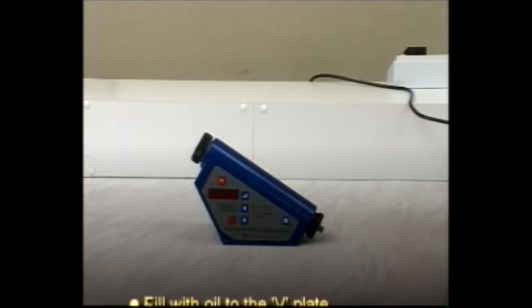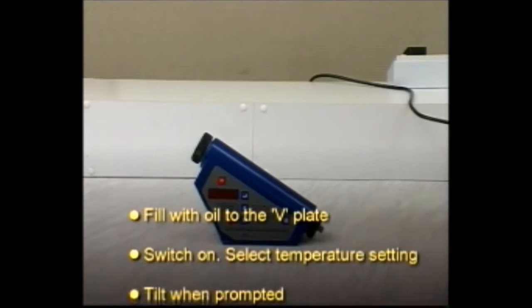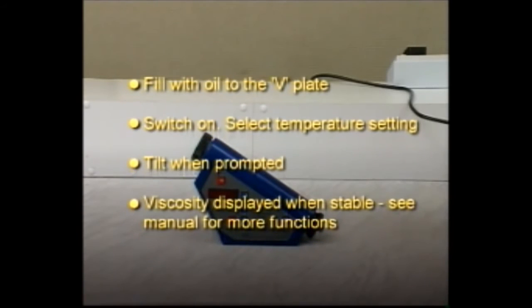To summarize, fill with oil to the V plate, switch on, select temperature setting, tilt when prompted, viscosity displayed when stable. See your manual for more functions.